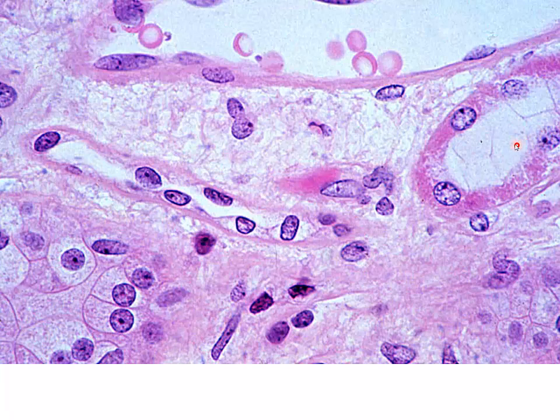Here's one of our thick limbs, but what we're clearly going to be able to see, we've got red blood cells, and so we know we're going to be part of our peritubular capillary network or part of our vasa rectae. We don't know arterial versus vena rectae at this point, but we know we're in part of the circulatory system. But then we get to these really flattened cells close together, very little, if anything, in the way of lumen, but no red blood cells whatsoever.